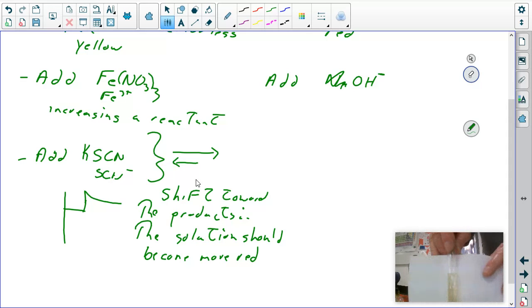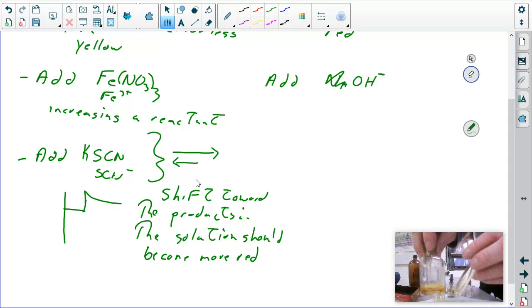We have a nice bright yellow equilibrium. So if I add it's a little bit darker yellow in this case, but it's partially because what I've created it in is an older compound.